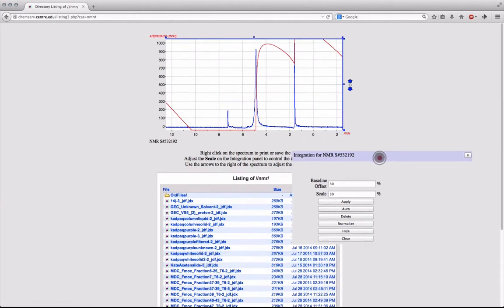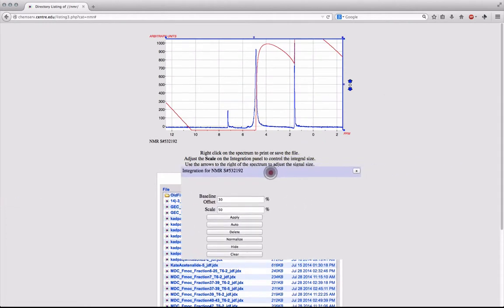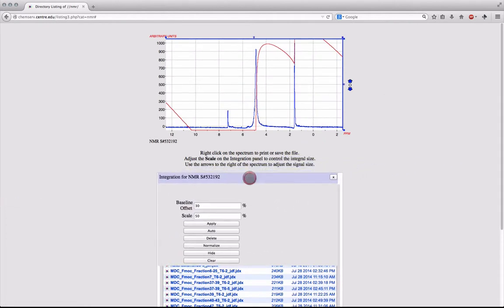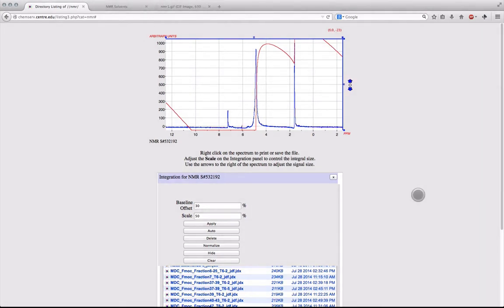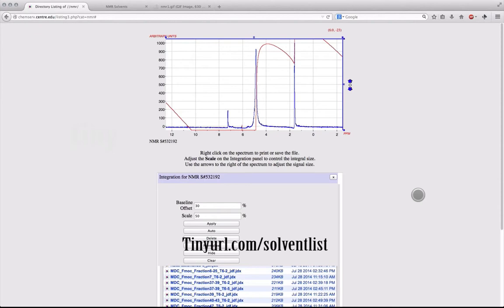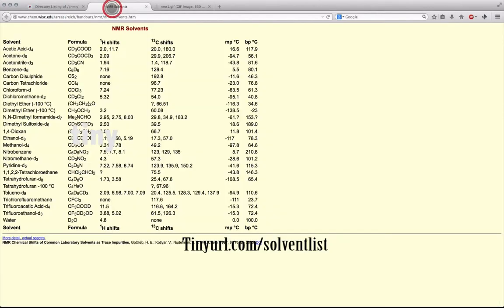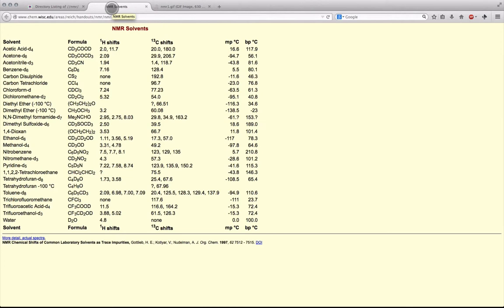This will bring up an interface in which you can integrate the signals within your spectrum, but before you do this, what you may need to do is remove any common solvents or impurities found within your spectrum. By entering the URL found on the screen, a solvent list will pop up containing all the common solvents found within NMR spectra. Here you can see we have a signal exactly where deuterated chloroform appears.